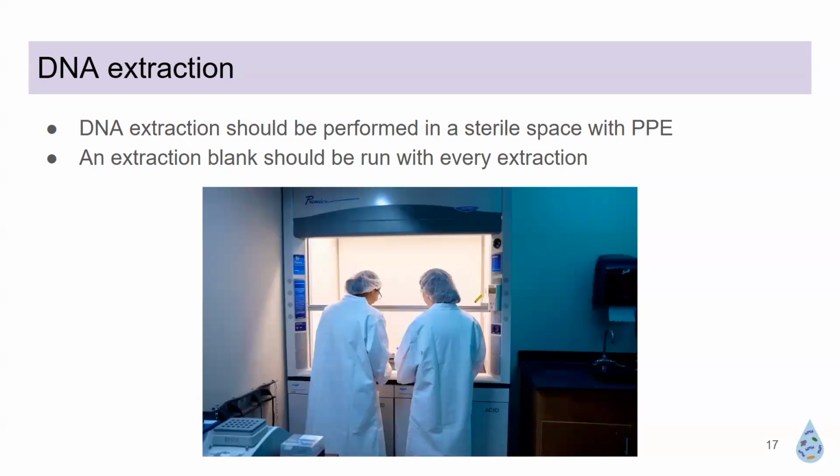The next part is DNA extraction. So once you have your samples, you've filtered them, now you're ready to extract the DNA. Again, sterile space. This can be done within a fume hood, that's best practice. And you want proper PPE. And what I mean by proper PPE is looking like a lunch lady. So you want a lab coat, you want a face mask, and you want a hairnet.